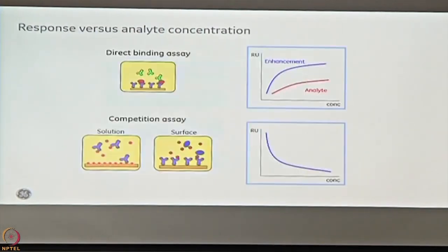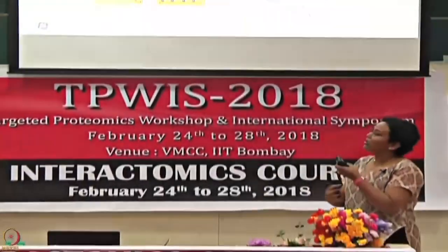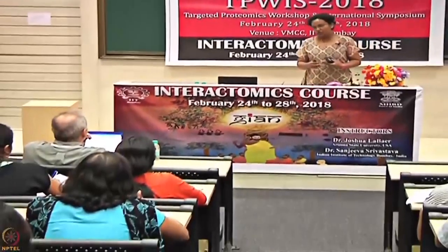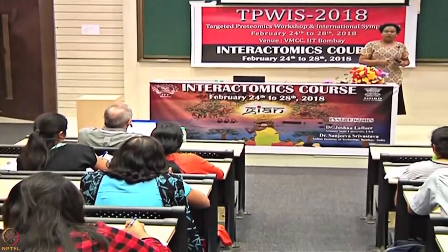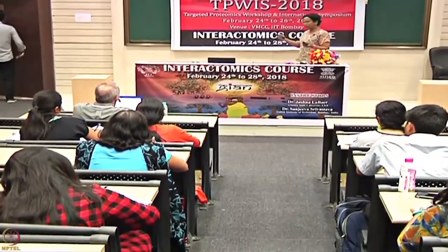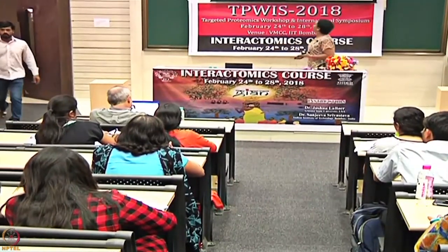Yes, sir. On the direct enhancement, how are you going to get the rate constant somehow? Or isn't that dependent on the rate of the enhancing molecule? That's right. So you probably will not get the rate constants there. You can only do certain applications like concentration determinations. Oh, I see. Yeah, that's a very good point. So these are the various formats that are offered, but it is limited to what applications you are using them for.